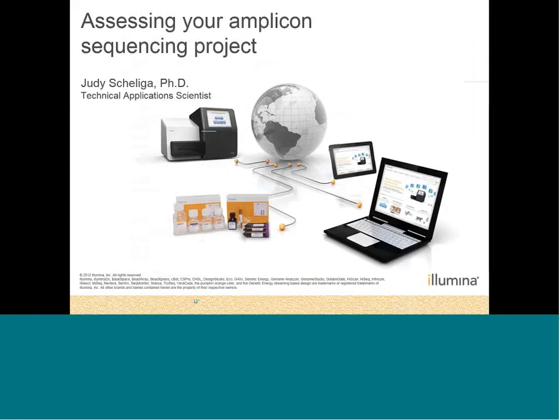So today, as Megan mentioned, we're going to talk about your Amplicon sequencing project and how to assess the data. And so I want to start by giving you an outline of what we're going to talk about today. So I'm going to start by giving you an overview of the Illumina Amplicon workflow.